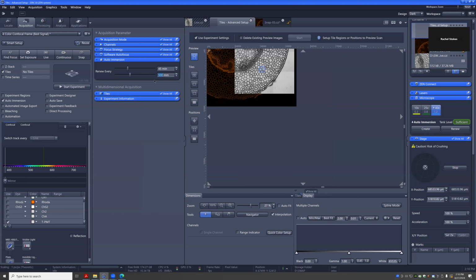500 millimeters. That's weird. Oh no, this is for X and Y. This is mostly set up for larger jumps on X, Y, right? If you're going a certain distance, you're going to move out of the drop. So if you have a larger sample and it knows you move beyond this distance, it'll add more. But you can't change the volume. I don't think the volume is here, unless they change it in the software version, but I don't think so.